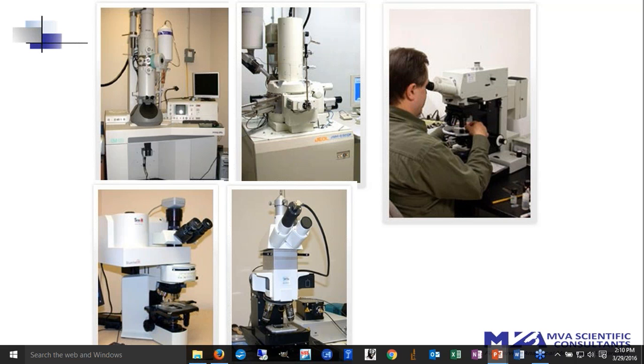Some examples of what they look like, for those of us that don't know. In the upper left, we have a transmission electron microscope. In the center, we have a field emission scanning electron microscope. We have Randy sitting at a polarized light microscope on the upper right. Lower left, our FTIR microscope, which is an oldie but a goodie, and a confocal Raman microscope.